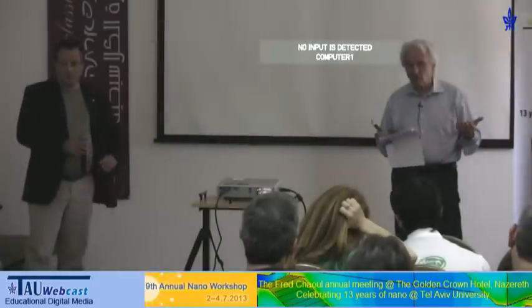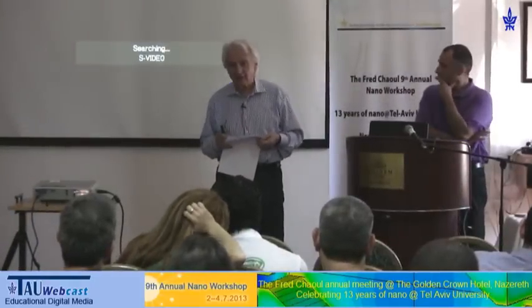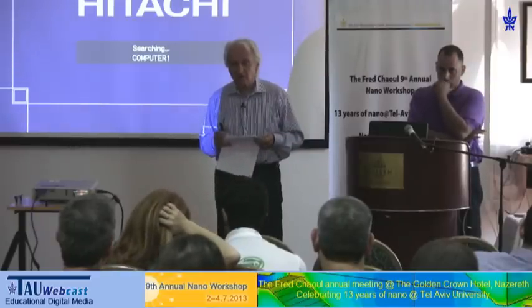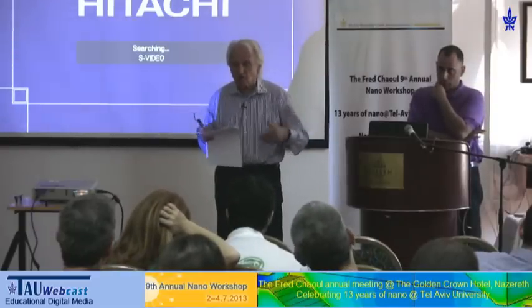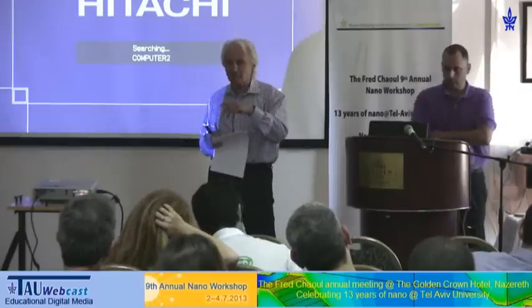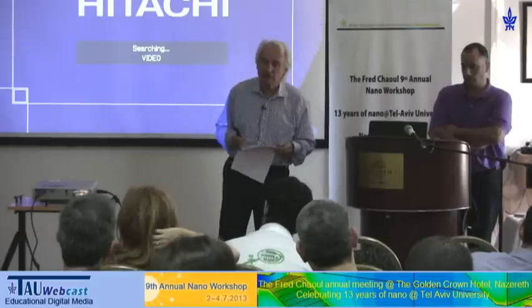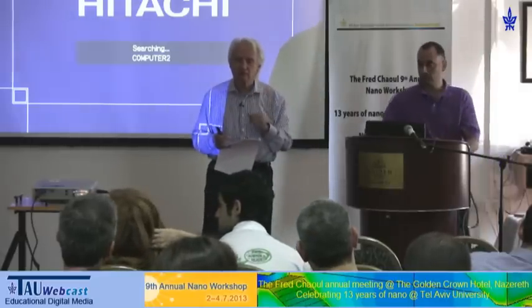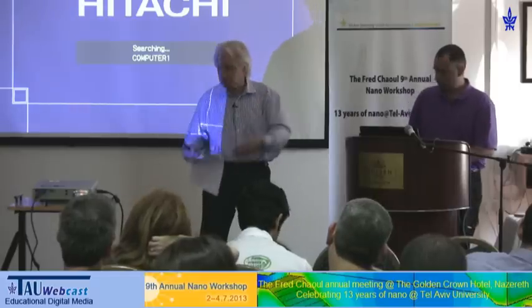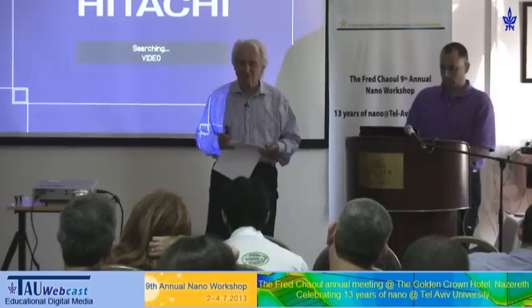In addition, we have coherence effects, which also limit the resolution, and mechanical instabilities. Part of the factor comes from this. So we have, both in TEM and STEM, a factor which is a vibration of about 15 to 20 picometers, which is instrumental instabilities, soil vibrations, and whatever. So you're right, we still have some way to go.